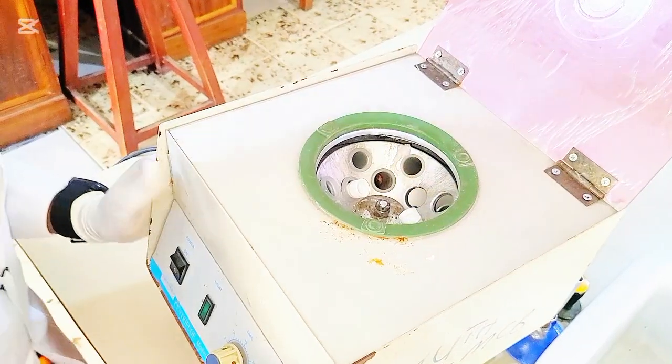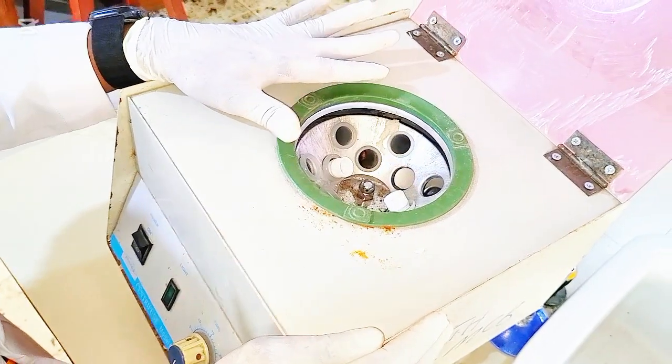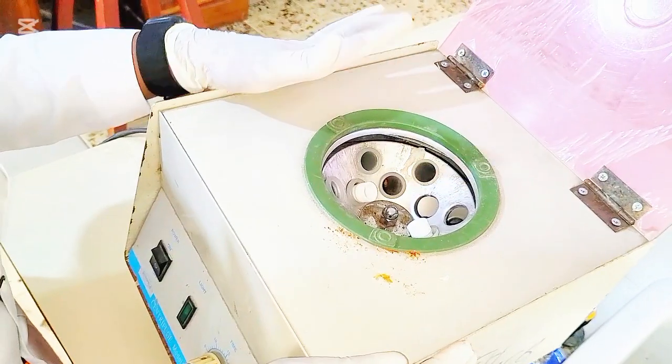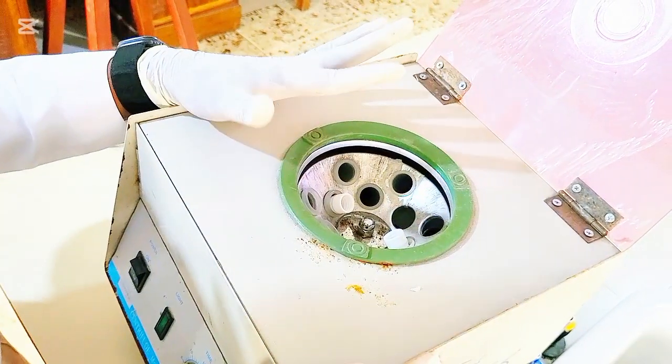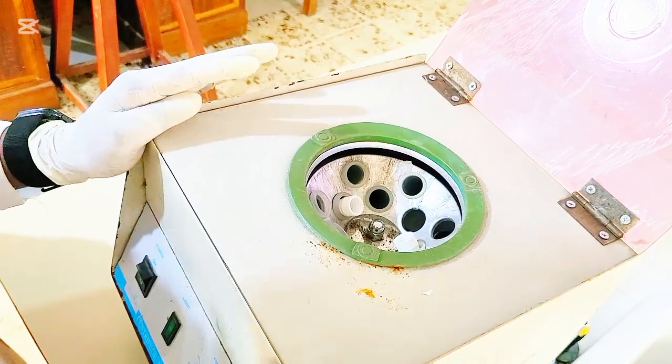So now we use our bucket centrifuge to spin urine. Like I said earlier, we spin at 3,000 revolutions per minute for 1 minute. We don't want to spin too much so we don't distort the shape of parasites or bacteria or anything if present. So we don't spin for long.